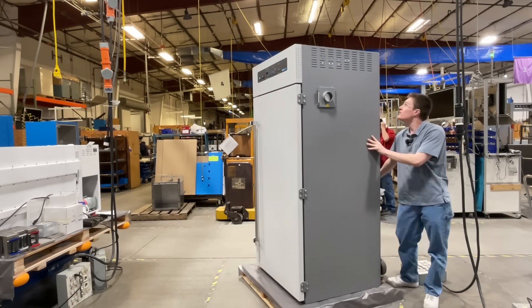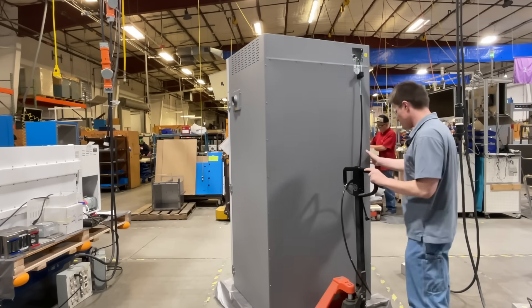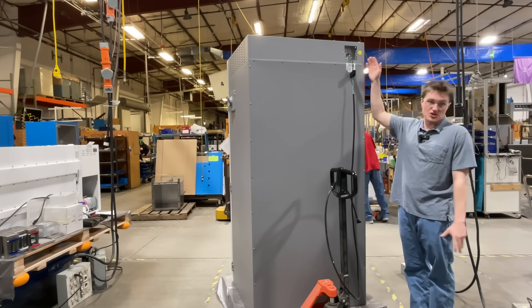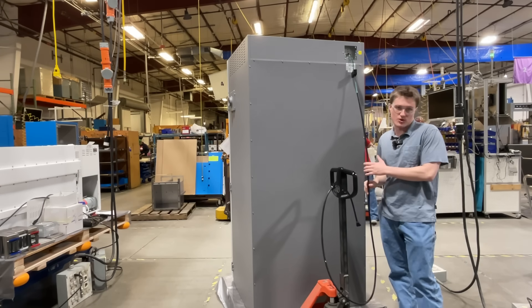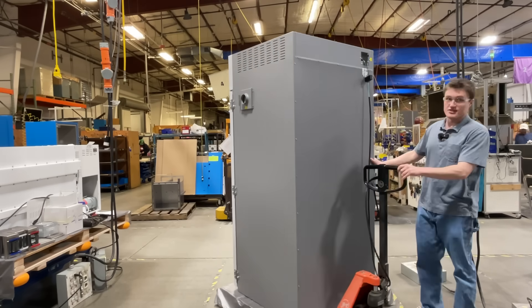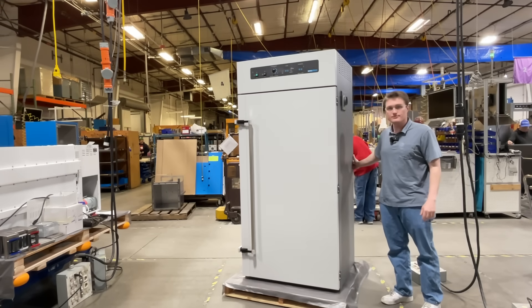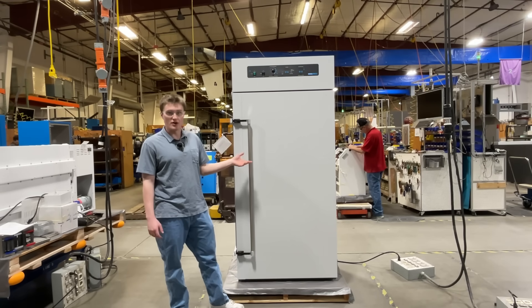Coming further around, we'll find the backside, which features the electrical connection for the unit. This unit must be hardwired to a securely grounded electrical connection. For the purposes of this video, we have installed a power cord. There are multiple considerations to make when properly placing and installing your unit — please refer to the user manual for details. After properly hardwiring your unit to electrical power, it is ready to be turned on.